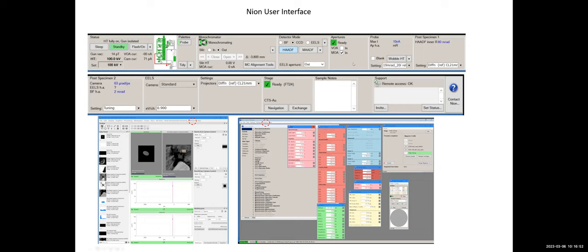And then you can see on this position, it reads aperture. If you read the label, it says VOA. So what is VOA? If you think of other microscopes, it's equivalent to condenser apertures like C1, C2, C3. So VOA is just the one condenser aperture.